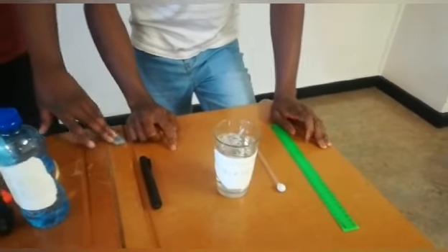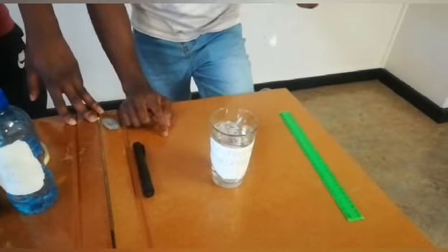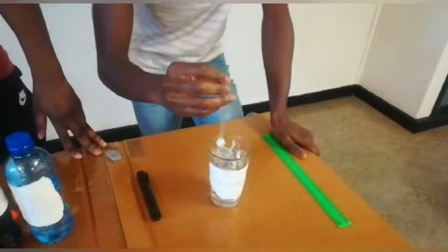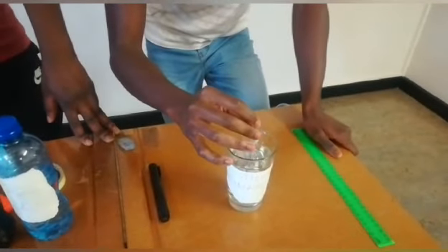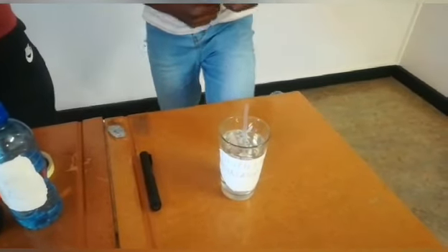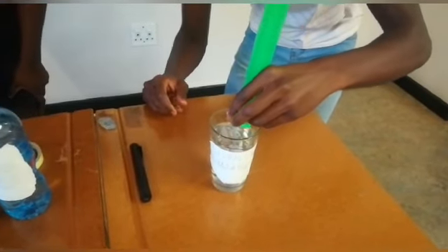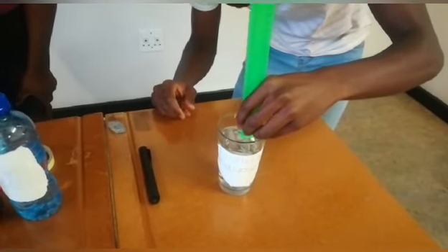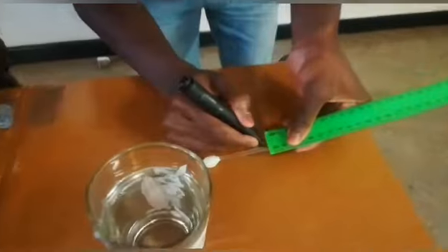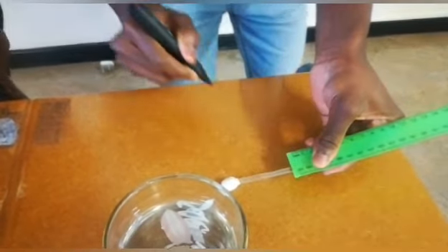Now for the calibration of our homemade hydrometer, we're going to need a ruler and our sealed straw, which we're going to submerge into the distilled water. We're going to use this ruler to measure and take the mark where the straw is at the surface of the water. Then we're going to use this marker to take a mark. This is our first marker.